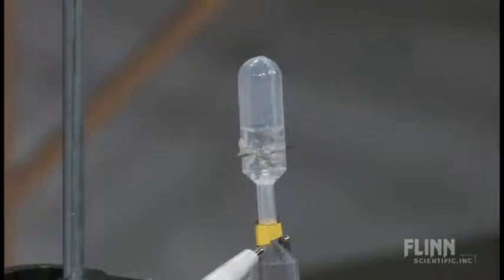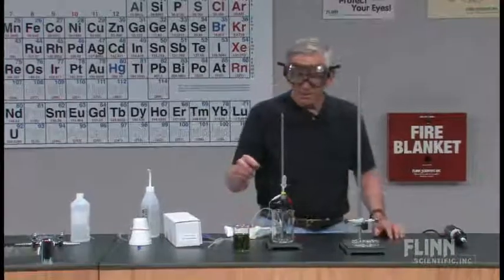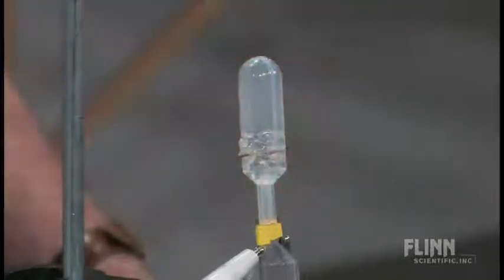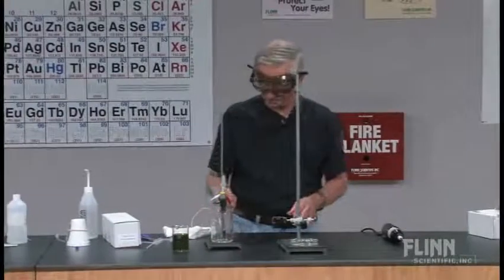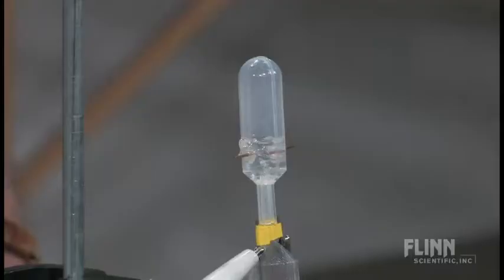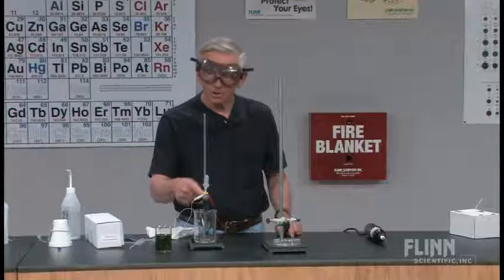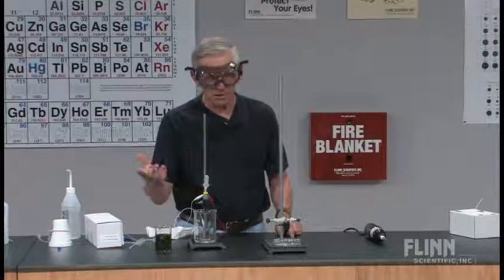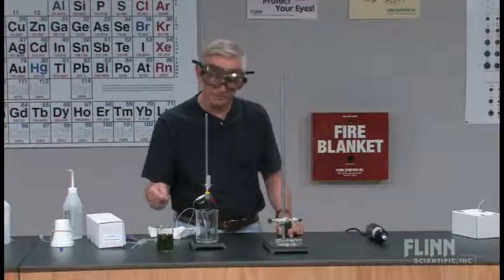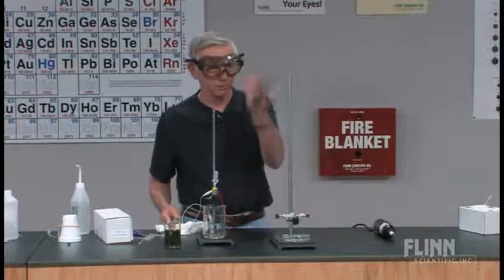This time when I set it off, I'm going to have a little bit different situation, because what I want to do is have it work so that the spark jumps from one of these wires to the other. So what you're going to see is I have to ground one of the two wires, and then I'll touch off the other one. If you're going to do this, by the time you get through two of these pipettes full, especially if you do it again, the carbon electrodes will have deteriorated enough, and you'll be able to see this towards the end. Maybe you can now. There's particulate matter down here. Those electrodes are slowly decomposing.